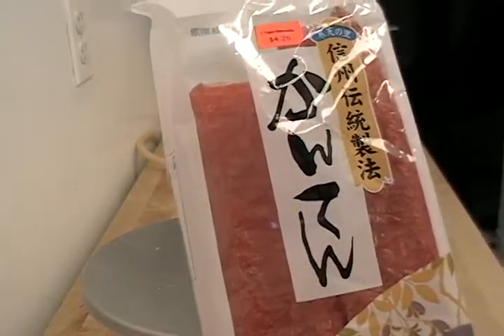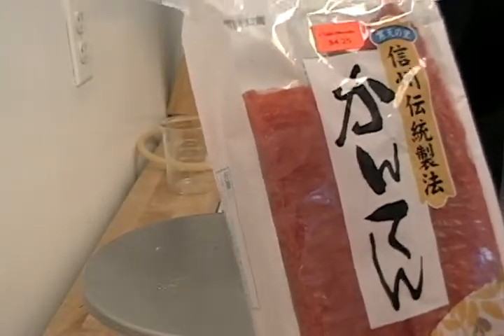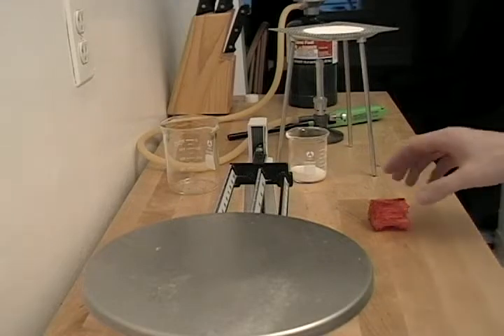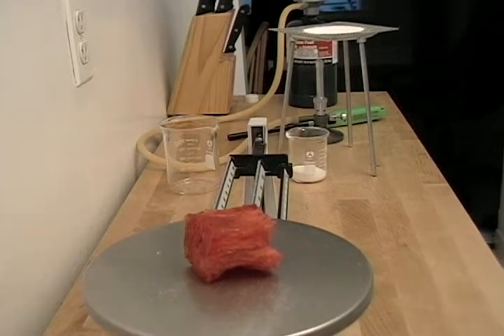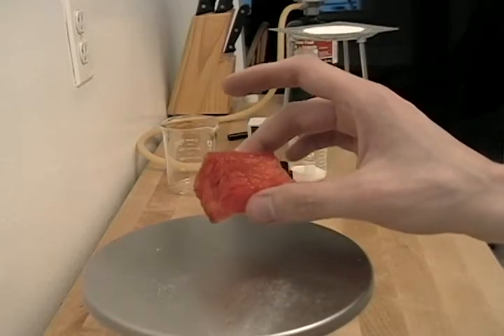I bought this brand because it was the most readily available to me — it was just in one aisle of Japanese supermarkets, so whatever works best. Now we need to rehydrate this in some water for about 30 minutes.